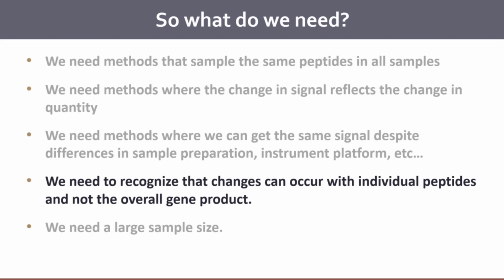Now don't get me wrong, that's what people want to do, but what we're measuring is a peptide. And we know there are a lot of proteoforms. In fact, if you ever hear Neil Kelleher talk, he'll go on and on about the importance. He wants to measure 1 billion proteoforms, but actually it's really important. There really are proteoforms, and they're complicated, and a lot of them are still completely unknown. We know that some proteoforms are disease specific and some are not, and it's really hard to try to wrap them all up to the protein, and what even is the protein. I'll give you an example here in a bit. The functional form of the protein is not known in many cases.